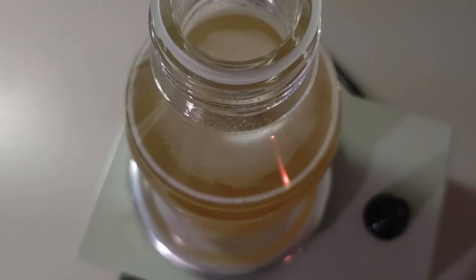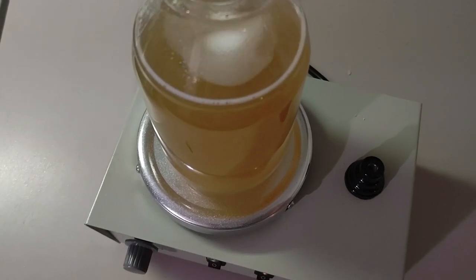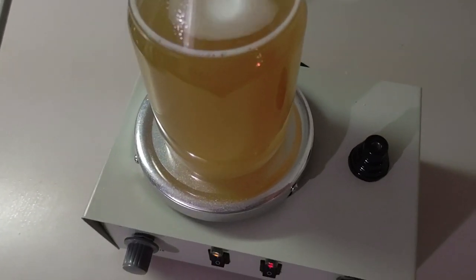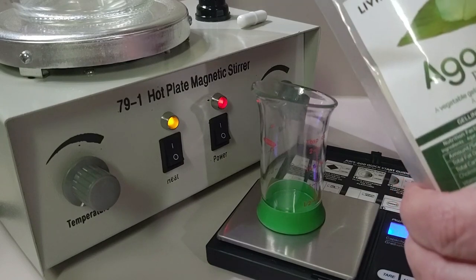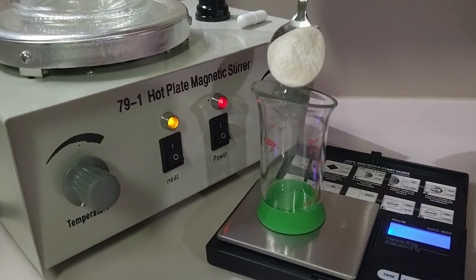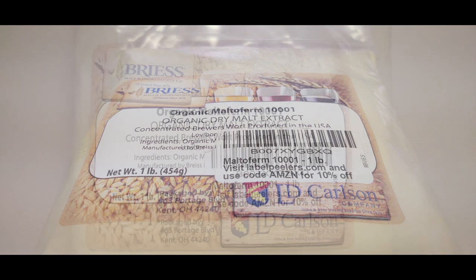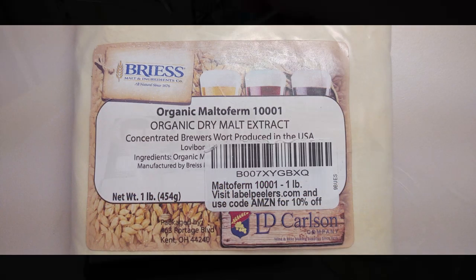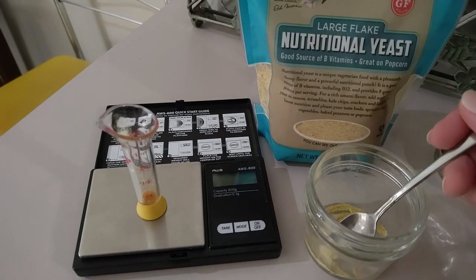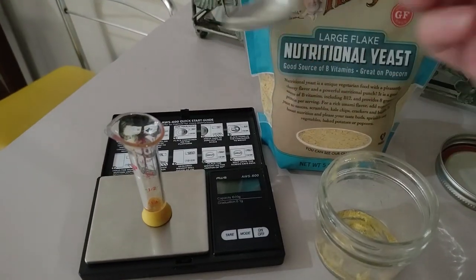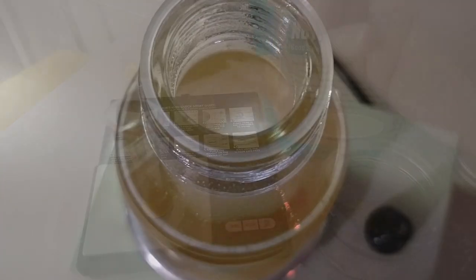We experimented with many different recipes, and we really feel like we've perfected this one. When creating 500 milliliters of agar, you want to use 10 grams of agar, 7.5 grams of malt extract, and 0.25 grams of nutritional yeast. Yes, that's 0.25 grams of the nutritional yeast to create 500 milliliters.